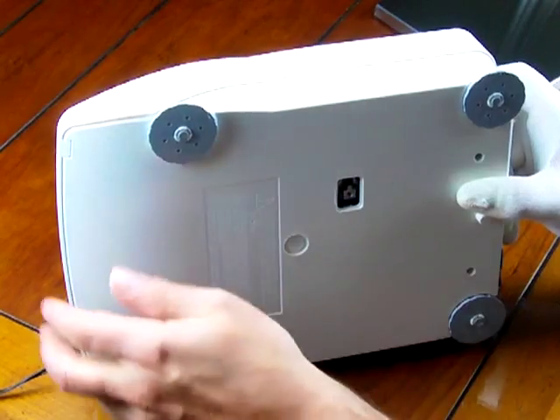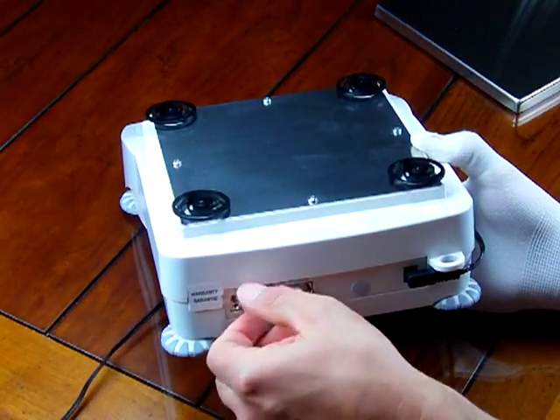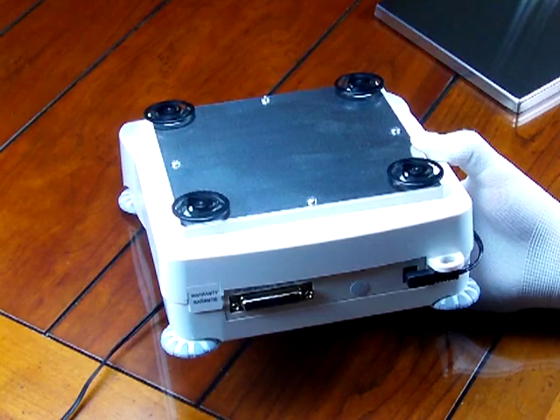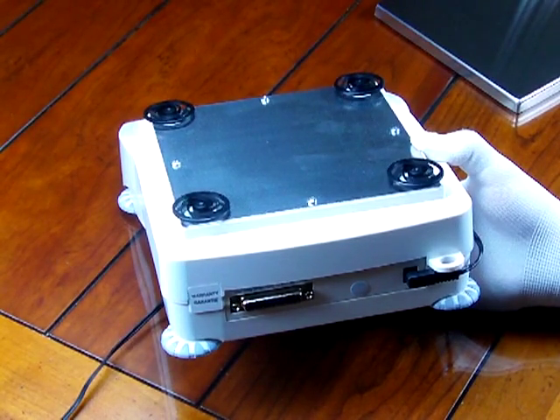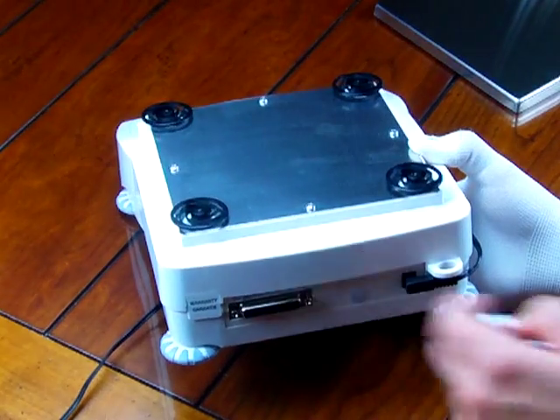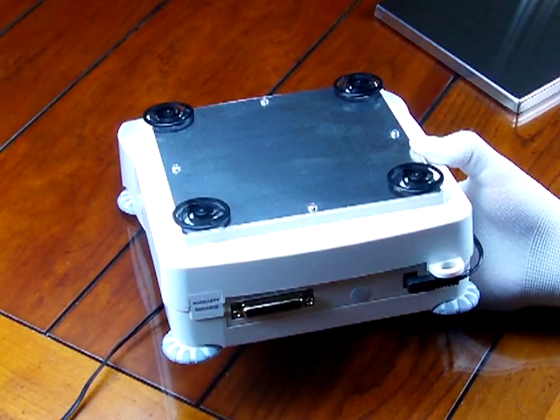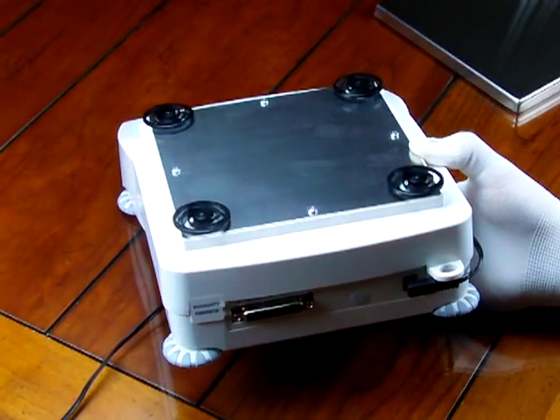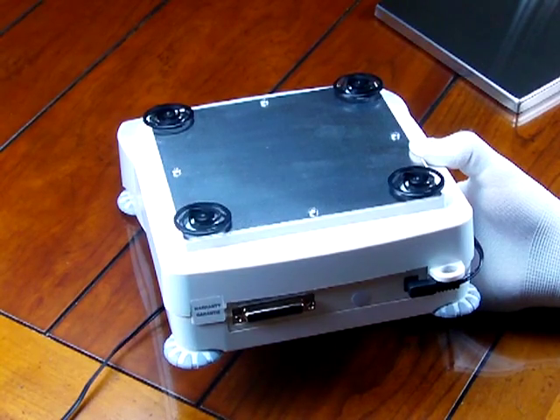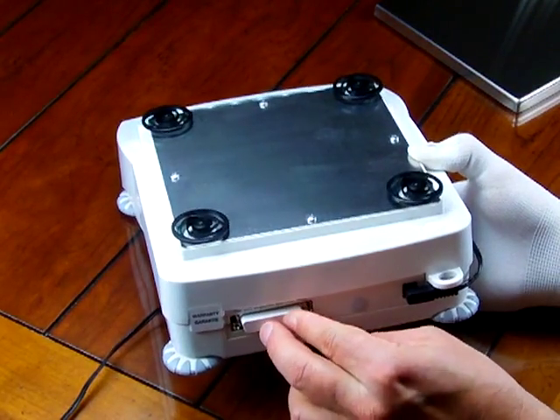We have four adjustable feet for easy leveling. On the rear of the balance is the RS232 interface — a 25-pin connector. If you want to connect to a computer, we highly recommend purchasing the Sartorius RS232 cable. The pin-out is in the manual, but it's best to buy it — you'd get a 25-pin to 9-pin for your PC. We also have a kit that converts RS232 to USB. The cable is optional, but the balance does have the RS232 interface.